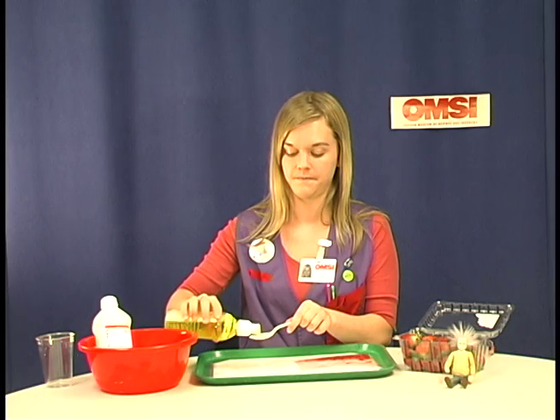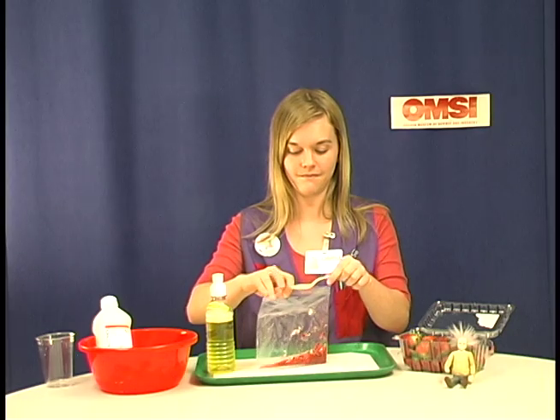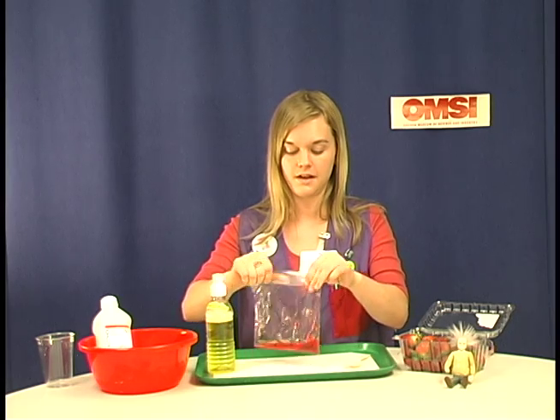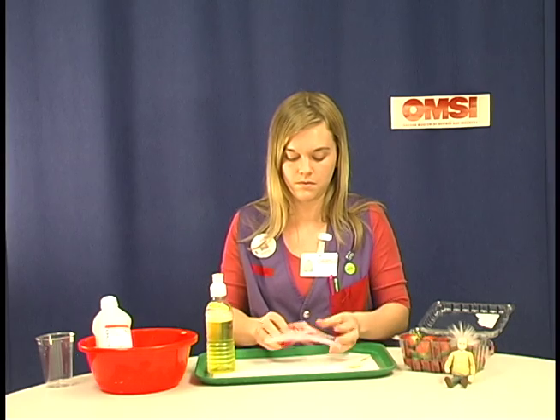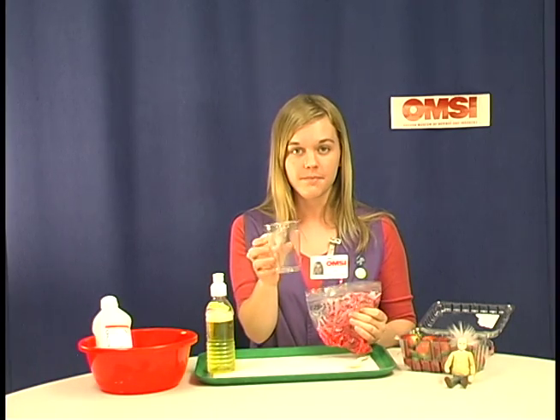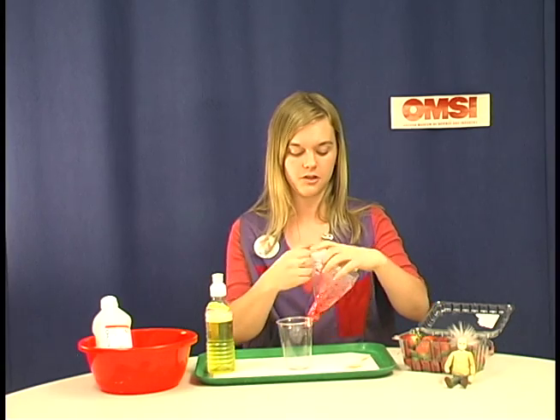Then you put in a spoonful of the soap mixture. Seal up your bag and have the students mix all of this together. Next you're going to need a tall clear cup, and you're going to dump the strawberry mixture in there.